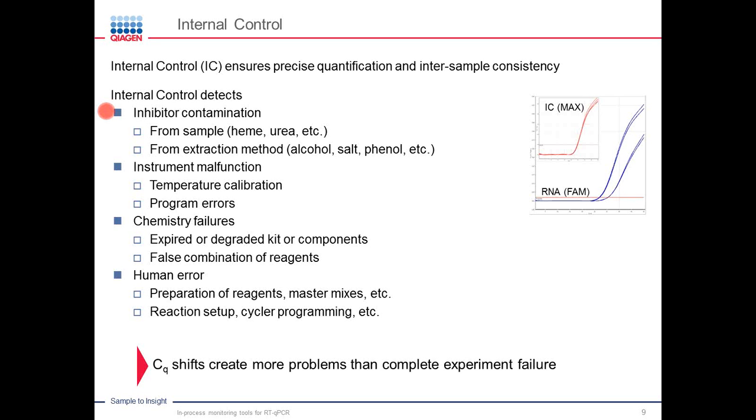So here is a list of what really can influence our quantitation and the precision of our quantification in qRT-PCR. And when thinking about that, it's almost scary at how many different points our experiment could be influenced, or in worst case even be spoiled. So most commonly, or the largest problem certainly, is any type of inhibition, particularly when looking at RNA.